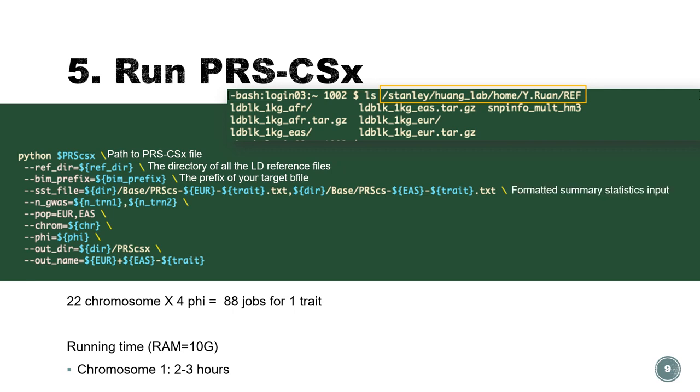Please note that you put a comma between different items and there should be no space in the list. And the list of GWAS sample sizes and the list of populations of the GWAS.